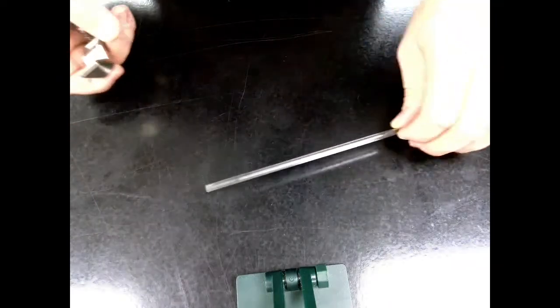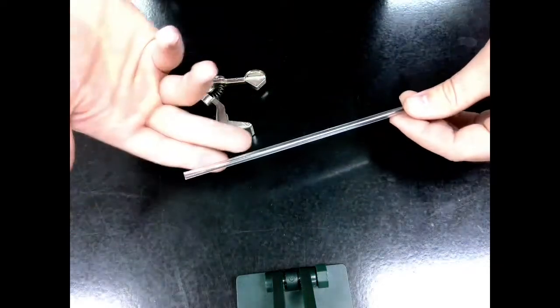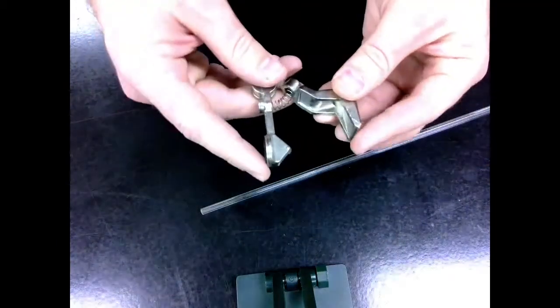In many labs, we need to be able to cut and bend glass tubing. So in this video, we're going to look at how to take a nice long piece of glass tubing and break it down into a smaller piece and put a bend in it. So the first step is we need a piece of glass tubing and a glass cutter.